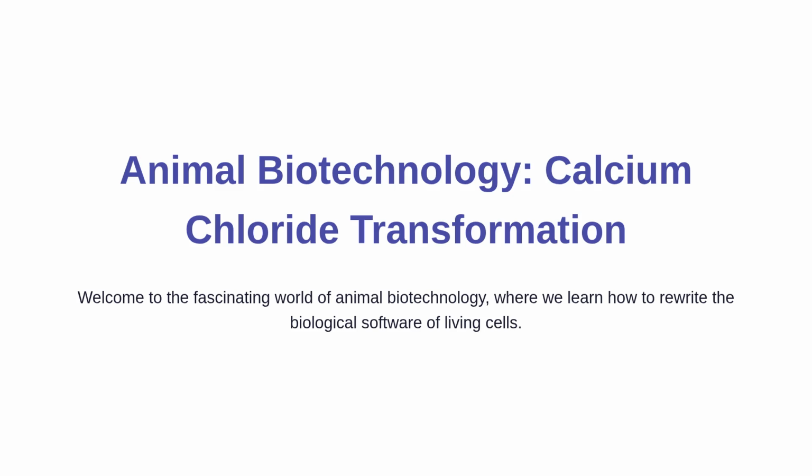Welcome to this lecture on animal biotechnology. Today, we are going to explore a foundational technique known as calcium chloride transformation. If you have ever wondered how scientists genetically modify organisms or mass-produce life-saving medicines like insulin, it all starts right here. We will build your understanding from the ground up, so let us dive in.